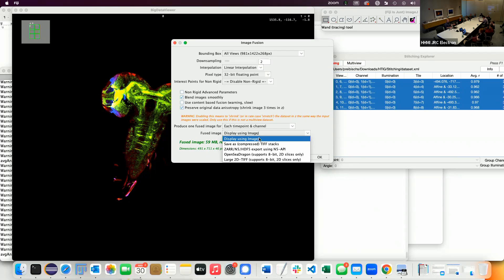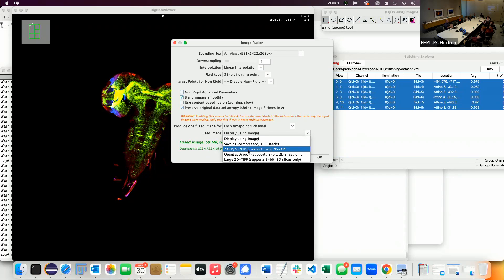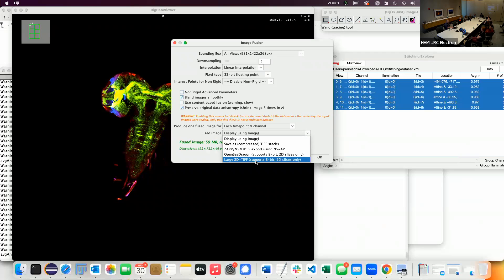We now support C-Dragon export for 2D — sometimes you want to export large 2D data and you can zoom in and out in this web-based viewer. We also support large 2D TIFF export for 2D images. Maybe you want to print this out or use one slice — ImageJ only supports up to 40,000 by 40,000 pixels in XY, and if it's bigger than that it will crash. If you have an image bigger than that you can export it now with the large 2D TIFF writer. This is only important for slide scanning in 2D or for artistic reasons.